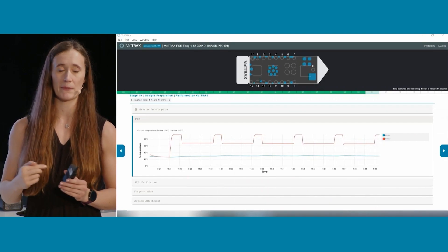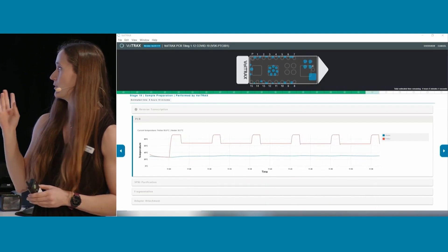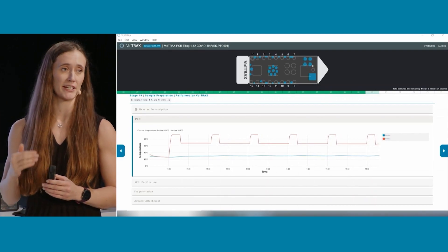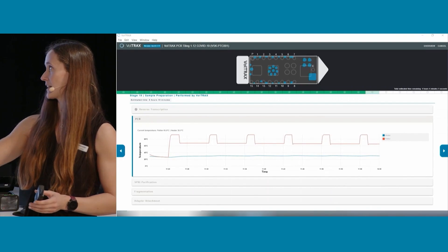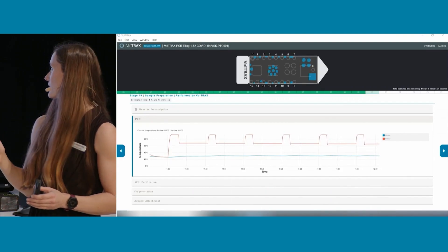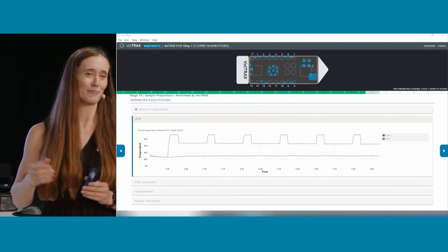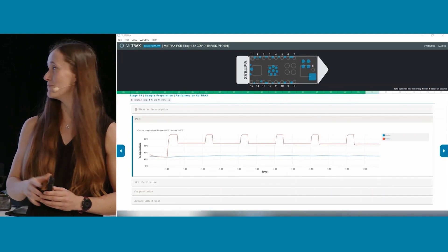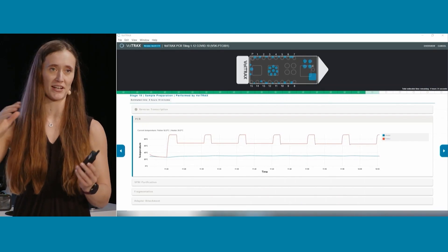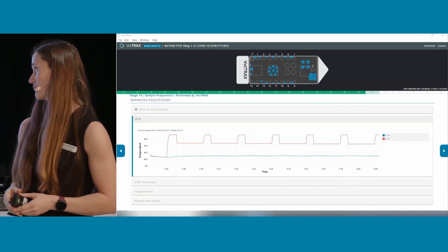When there are heating steps, you get an active graph showing the temperatures of the different peripherals being used — the heater and the Peltier. This graph is showing a two-step PCR, going up to 92 degrees Celsius and then coming back down. It will update as you go through more cycles.